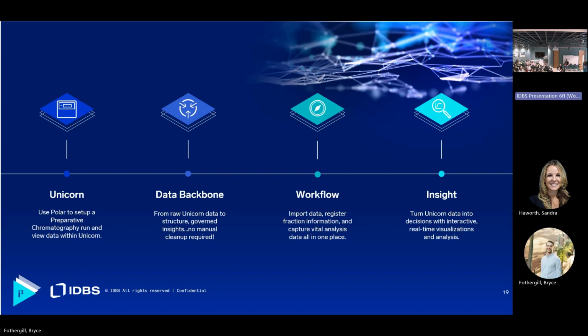Have you ever considered ligand binding also? It's for the chromatogram and you use the Unicorn software, but for ligand binding, there is Softmax Pro, and there are others, connecting to the backbone. Sorry, I just couldn't quite hear what you said.